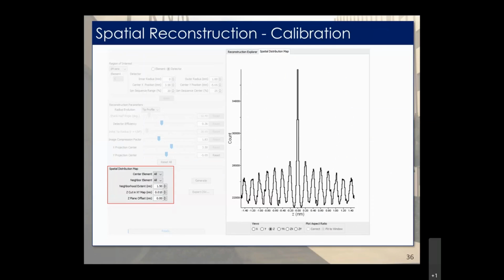If two atoms are on adjacent or successive planes in Z, the Z distance between them will be roughly equal to 1D, or one d-spacing. Each of these other peaks occurs because if we're measuring atoms that are 2 planes away or 3 planes away, we'll have distances of D, 2D, 3D, and so on. And it's symmetrical because, of course, the distance from an atom on the top to one on the bottom is the inverse of the distance from an atom on the bottom to one on the top.